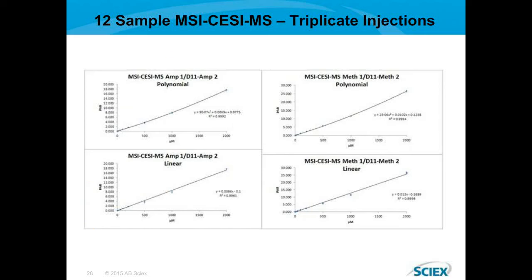And this shows, again with triplicate injections, the linearity of the amphetamine on the left and methamphetamine on the right.